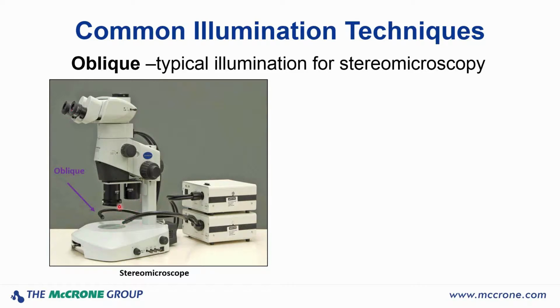Another adaptation to this is that you can take on either objective in this location, and you can put a ring light. It's got some limited uses. When it's useful, it's great. Sometimes it just doesn't do a thing for you, so you just get rid of it.